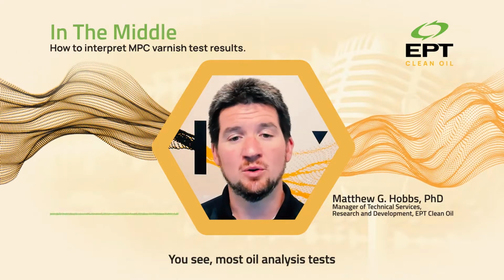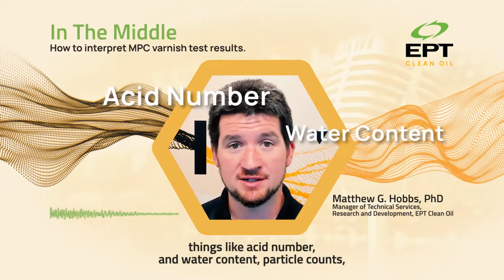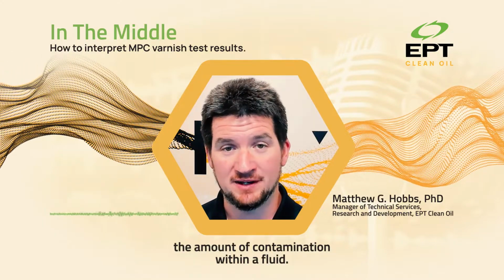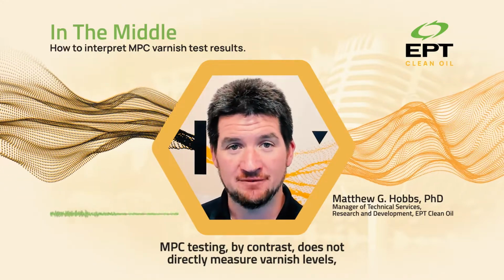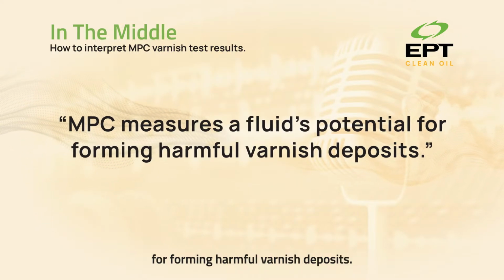Most oil analysis tests, things like acid number, water content, and particle counts, directly measure and quantify the amount of contamination within a fluid. MPC testing, by contrast, does not directly measure varnish levels, but rather it measures a fluid's potential for forming harmful varnish deposits.